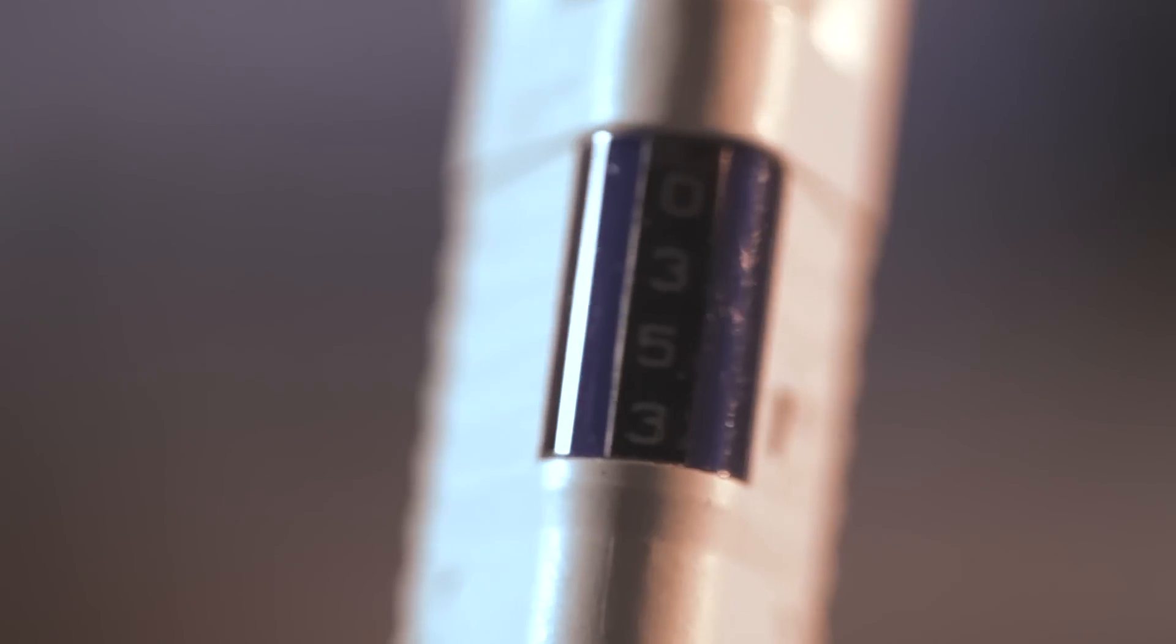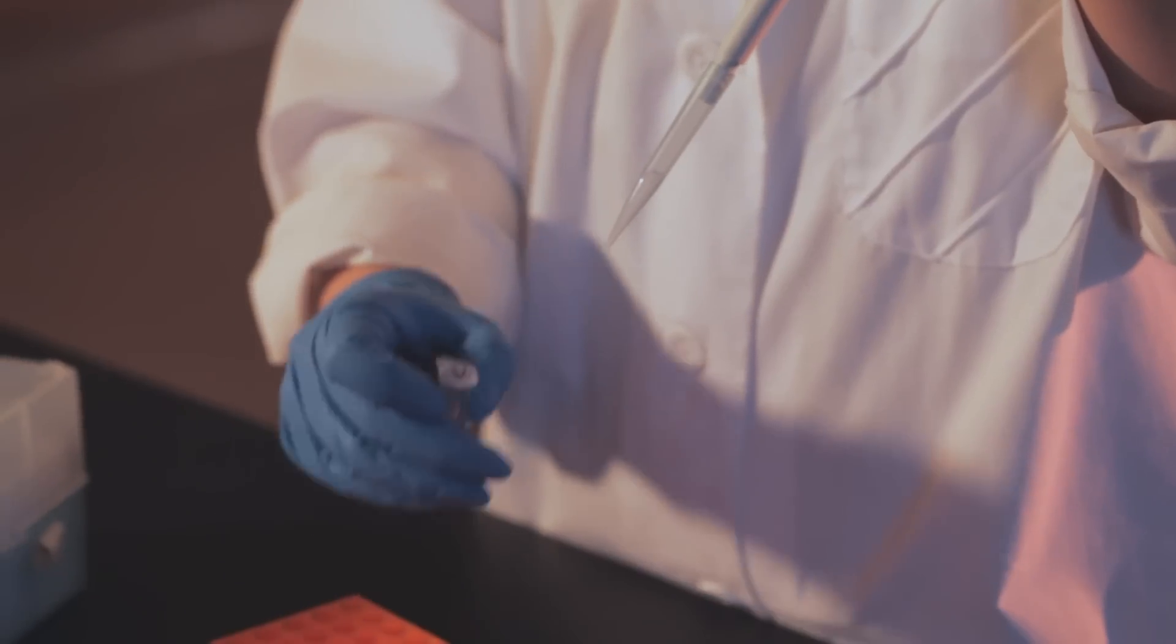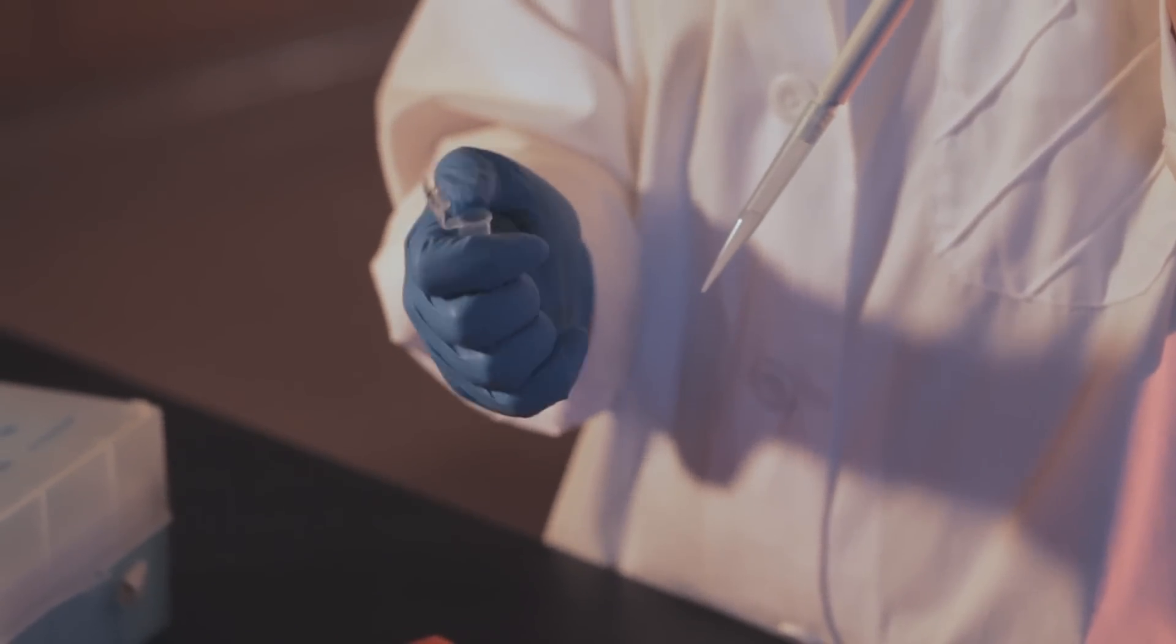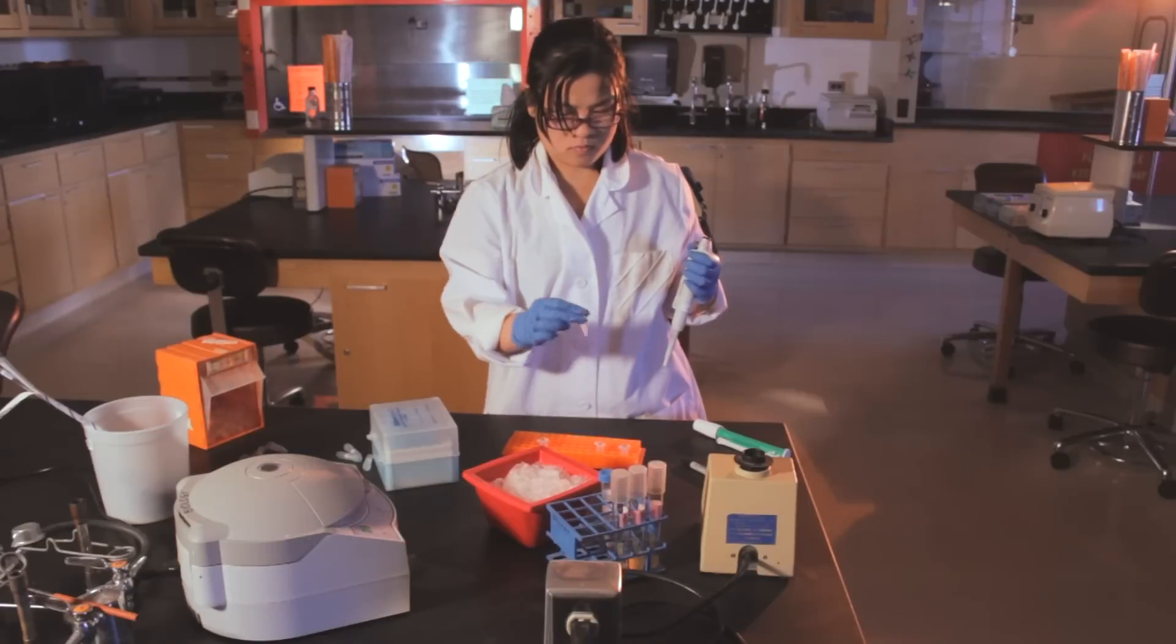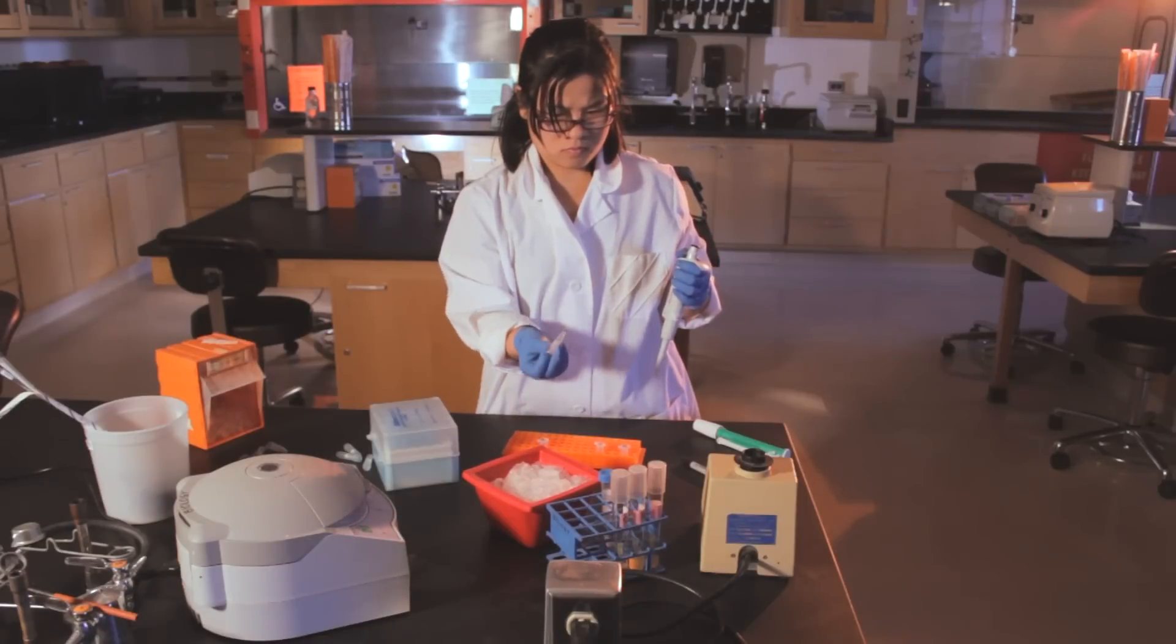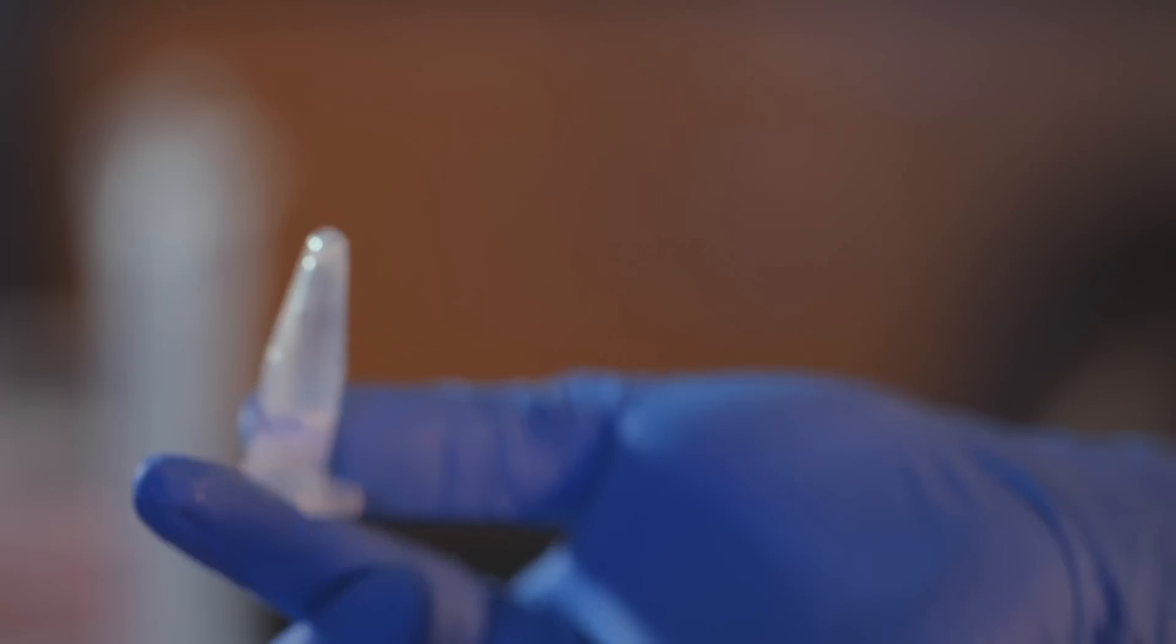Working quickly, add 350 microliters of neutralization buffer and mix immediately and thoroughly by inverting the tube 4 to 6 times. Do not vortex. The solution should become cloudy. If using a Qiagen kit, mix until all traces of blue are gone and the solution is colorless.